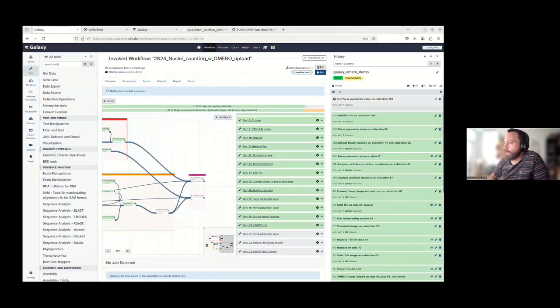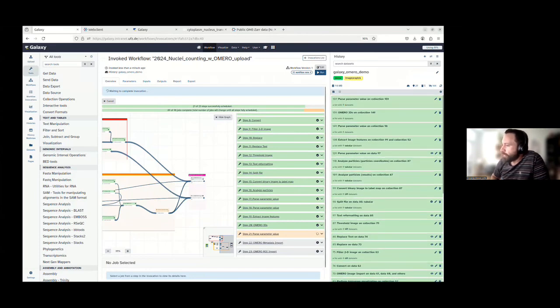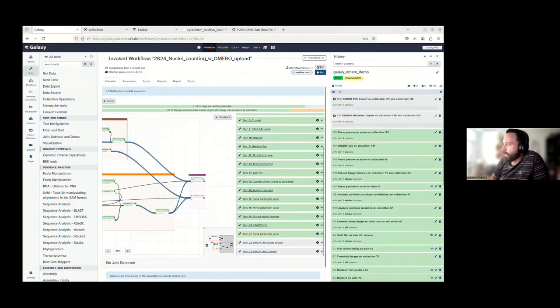And here there are parameter values. The tool that is running at the moment is just collecting image IDs from Omero in order to associate the results to the correct image. This is done. The last two steps will be to import the regions of interest and the metadata.